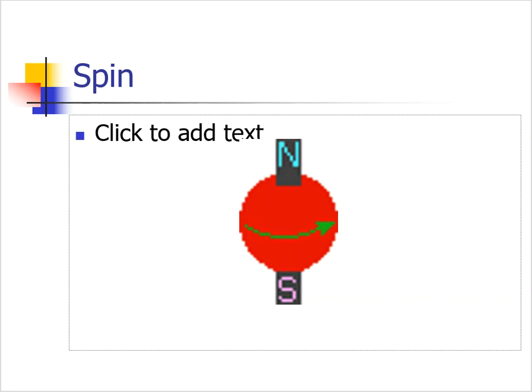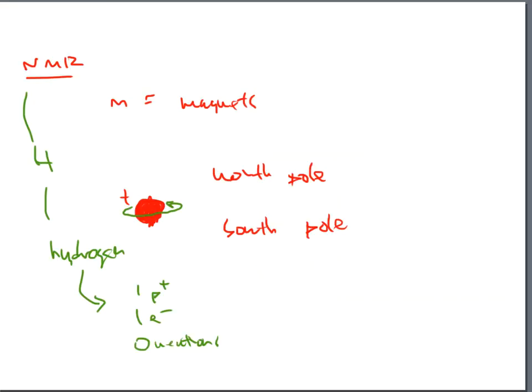Well, here's the problem. Let's say that I have a container, and that container has that compound in it. That container is going to have hundreds of thousands or millions of molecules that are all in that container. Maybe it's in a beaker, maybe it's in a flask, maybe it's in a sample container.